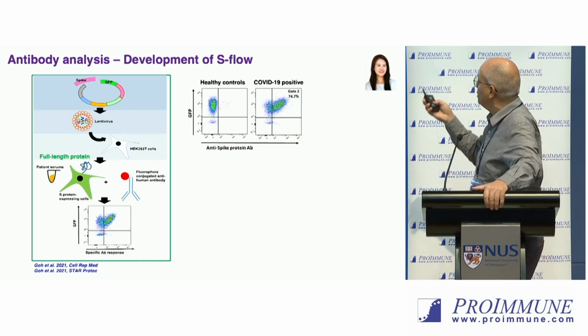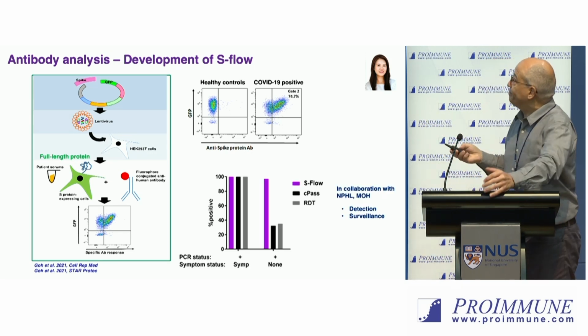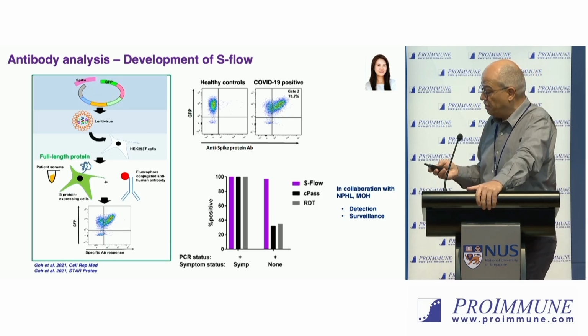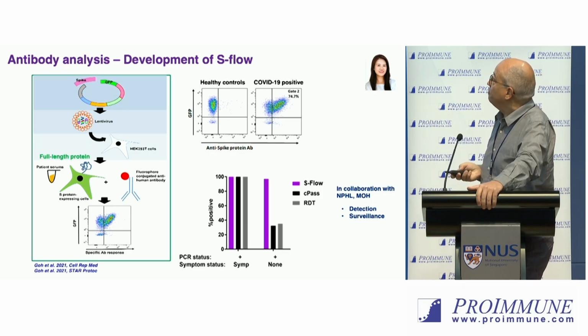So with Chian in the lab, we tested this for COVID. And we were able, in less than 2.5 weeks, to develop this assay for COVID. And you could see he's using serum from people who are positive. We have a very strong response.